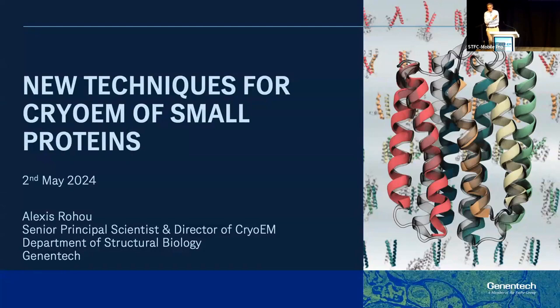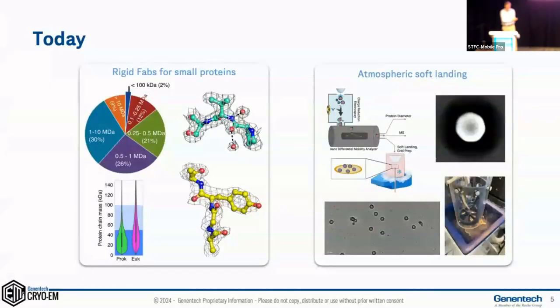Most of my bread and butter is drug discovery using CryoEM, which is more along the lines of what Sriram talked about this morning. But I want to tell you today about two technology development projects we have to try and help with one of the most common problems in CryoEM, which is that a lot of targets are a bit too small to be studied easily using regular single particle CryoEM. And so the two projects I want to tell you about are summarized here.